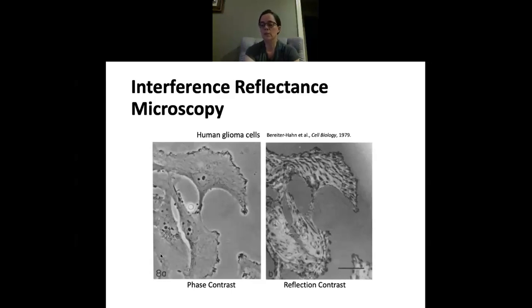So in some applications, the reflections off of an interface are strong enough to make observations without polarization control or digital enhancement, but that will depend on the sample and the degree of coherence of the illumination. So notice that the primary reflections here are at the interface between the cover glass and the cell, and they're due to the relatively large refractive index difference between them.